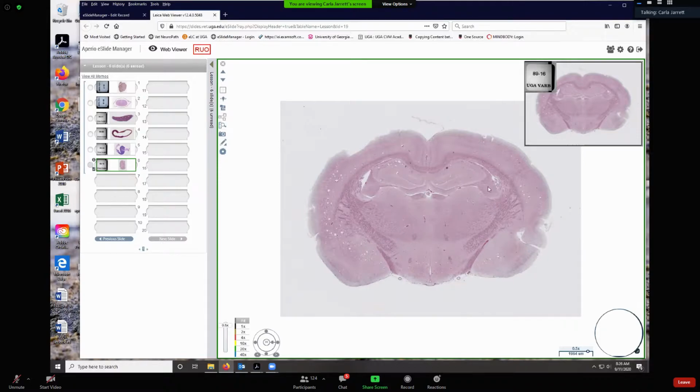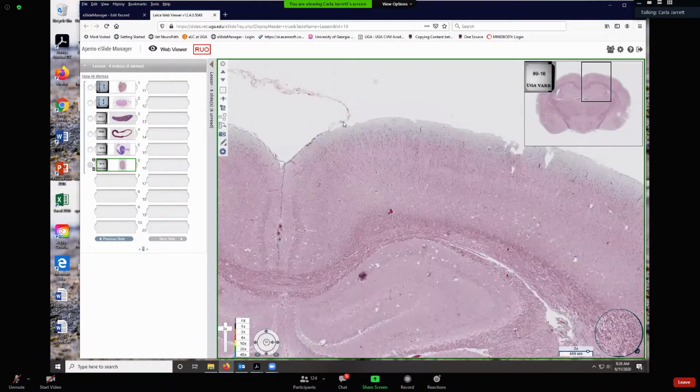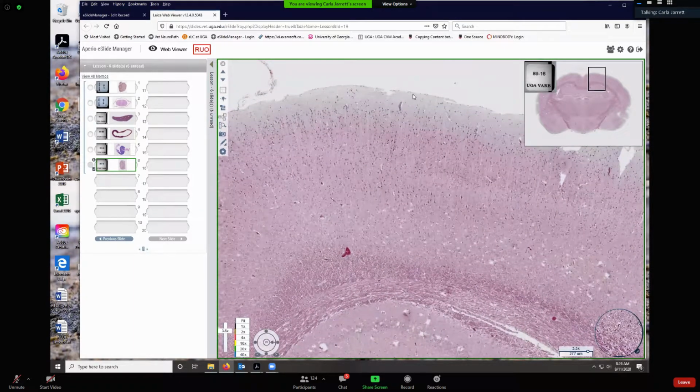instead of one that has gyri and sulci. We've got underlying thalamus and hypothalamus and brainstem, and you don't need to worry about all of this in this region. We're just interested in that cerebral cortex. So let's zoom in a little bit more from here to here. Here's the underlying white matter. Here's axons. So cortex refers to gray matter, okay? So the gray matter is from here on the surface down to where you start seeing the white matter. So if I drew a line here and then I drew a line here, that bracketed area right there would be the cerebral cortex.